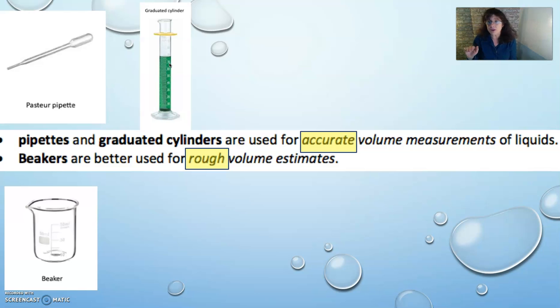No matter the shape, you always measure the volume of the liquid in the center of the meniscus shape. So for most liquids, not mercury, but most liquids, you're measuring at the bottom of the meniscus. And that's where you take the volume measurement. And check out that video that's associated with the labs, because it's well done.